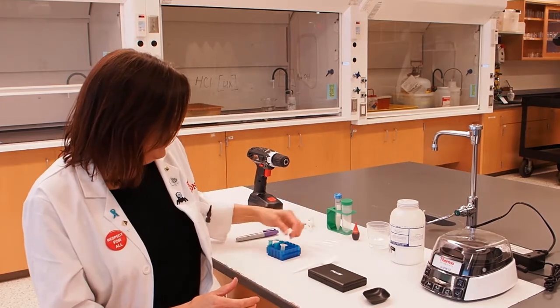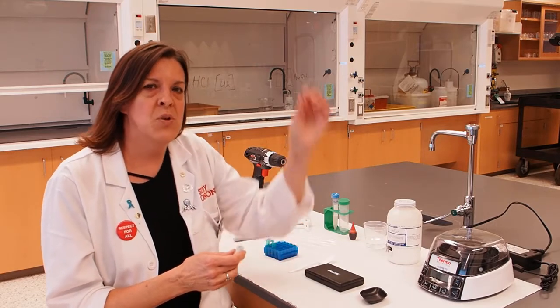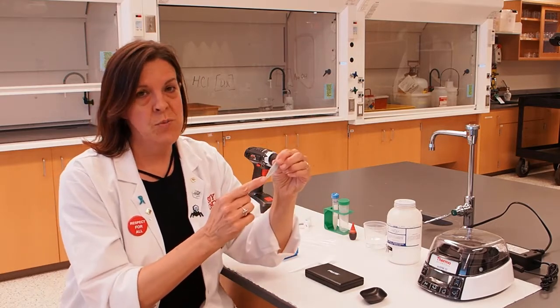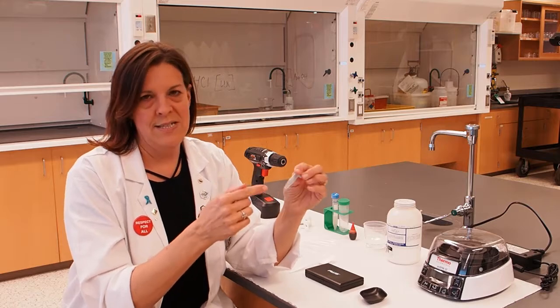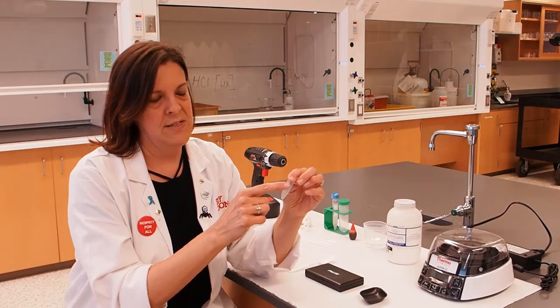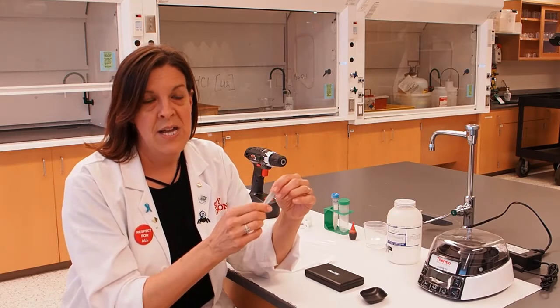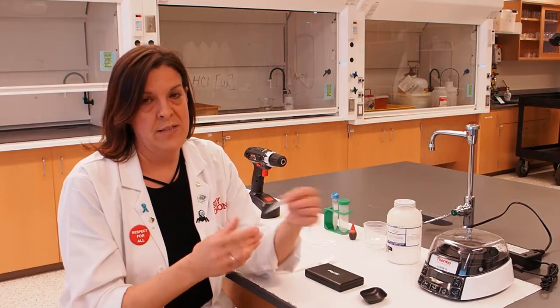What that's going to do is cause the solids or the heavier things in our sample to go to the bottom of the tube, and then the liquids or the less dense or lighter material is going to stay on the top. That's going to enable us to separate things from one another.